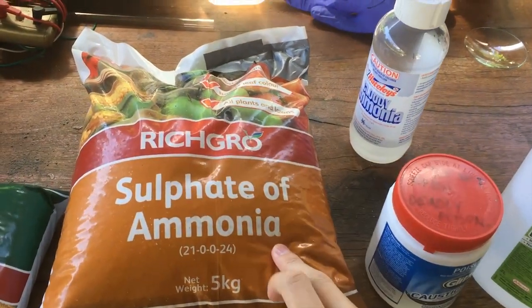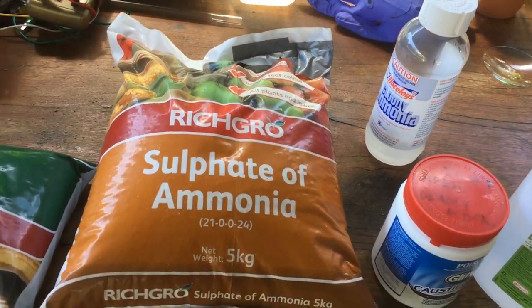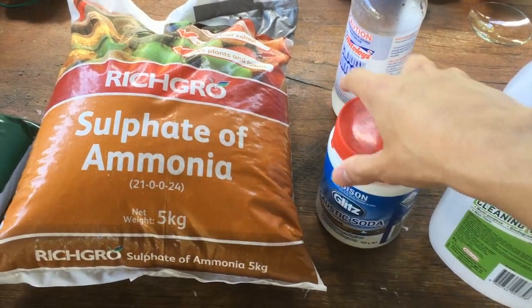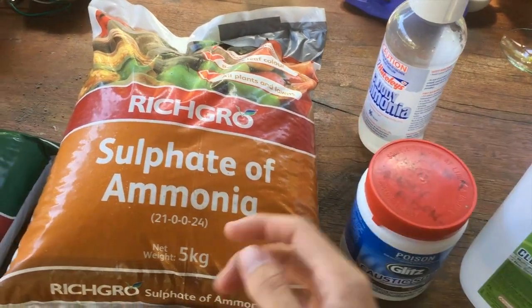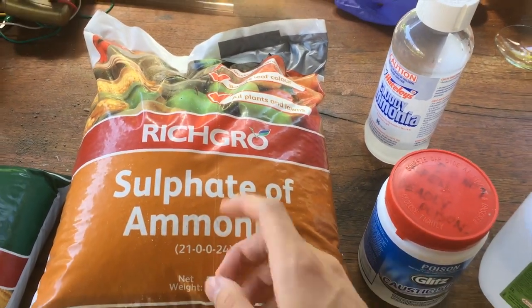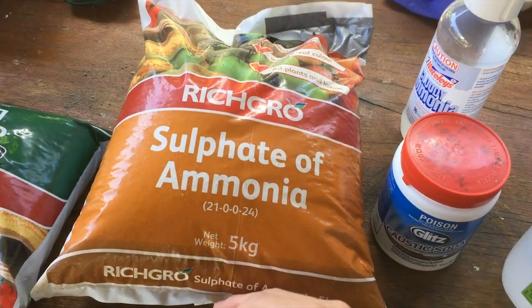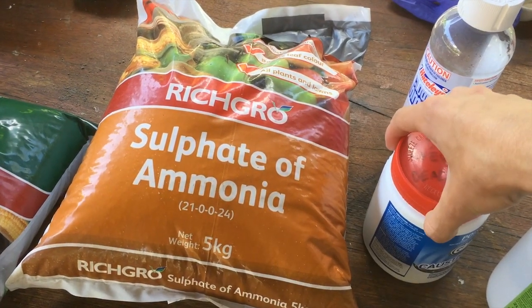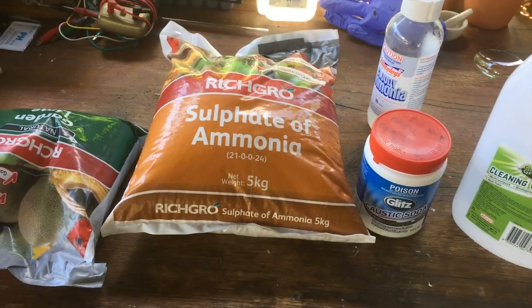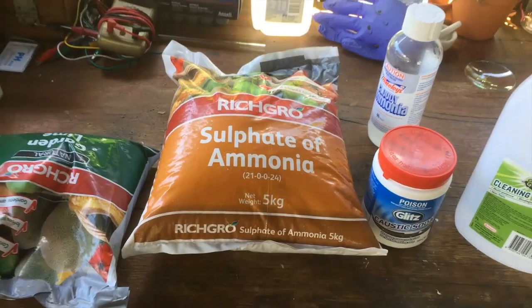Now the second method to make ammonia, which we'll use if the first method doesn't work, is simply reacting the ammonium sulphate with some sodium hydroxide. The ammonium ion will react with the hydroxide ion to form ammonia and water, and the sulphate will remain in solution as sodium sulphate. We should be able to cool it down if we make it concentrated enough and crystallise out most of the sodium sulphate. But we'll start off with the calcium carbonate to calcium acetate to calcium hydroxide to ammonia route and see how that goes.